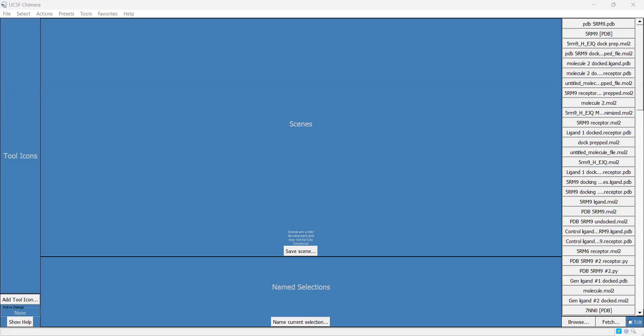Hello everyone, welcome to video one of this tutorial series on docking small molecules to proteins using AutoDock Vina within UCSF Chimera. Today we're starting with a coronavirus protein target, the coronavirus helicase NSP13.